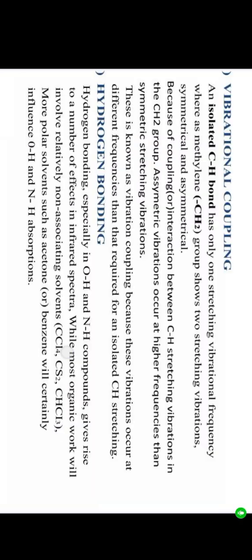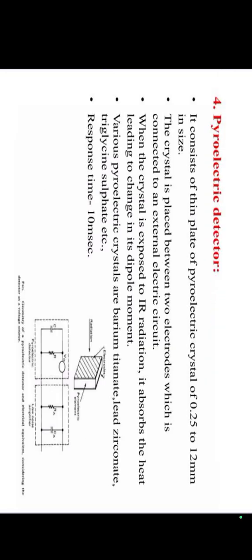After the detector, we detect the vibration, and the readout value is measured by computer analysis, and the readout value is displayed as a graph. This is the instrumentation of infrared radiation spectroscopy.